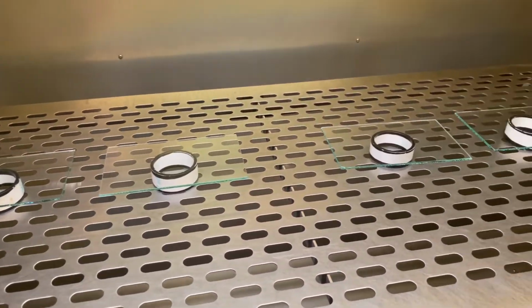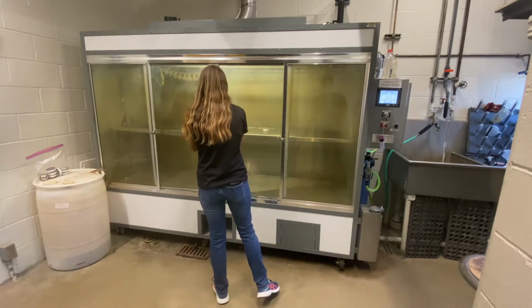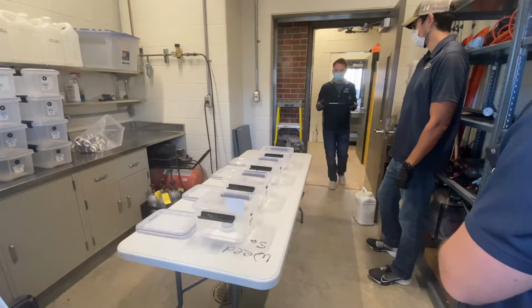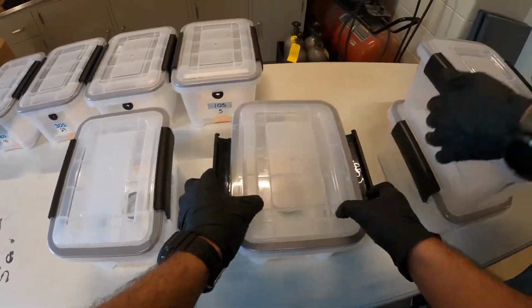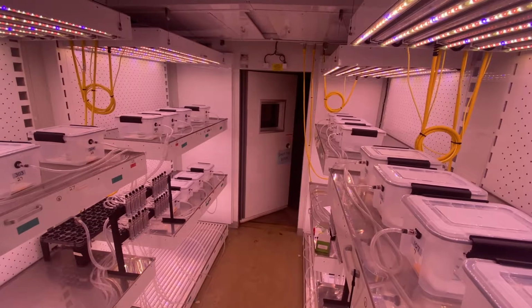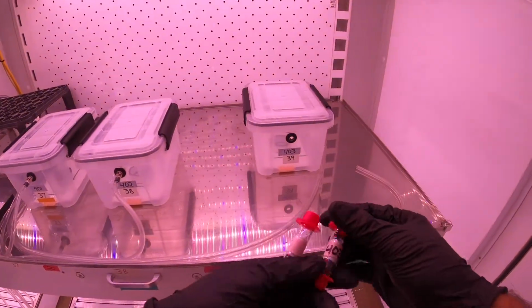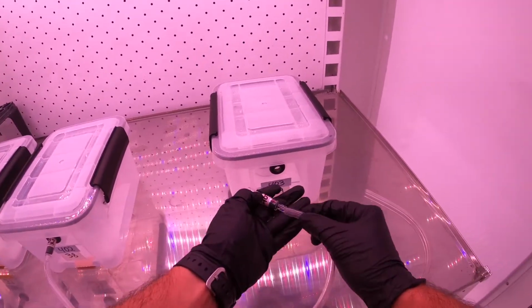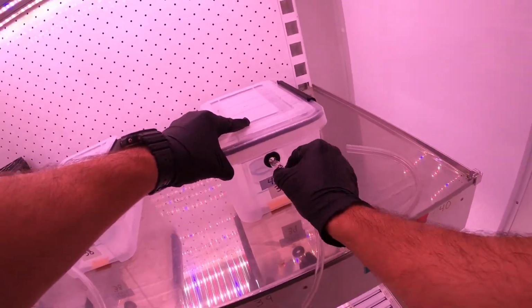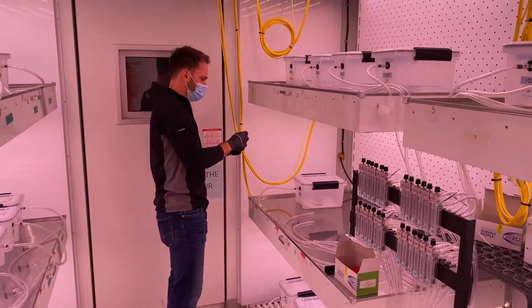In order to test our hypothesis, we start by spraying the glass slides within our spray chamber, then transporting the slides to a separate room and placing them within our volatility chambers. The volatility chambers are then transported to our controlled environment room, and they are hooked up to a vacuum that forces unidirectional airflow over the treated slides, where any volatilized dicamba can be captured by the air samplers and the air is exhausted out of the chamber. Then, 48 hours later, the air samplers are extracted for processing.